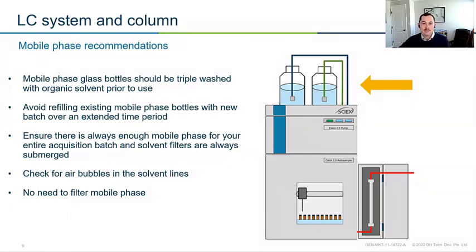Algae will grow in these bottles. And over time, you can end up with this pretty nasty film that can be pretty difficult to remove from your tubing. Honestly, it's just easier to replace the tubing. So when you're going to your LC system, make sure that you're not just refilling the bottle. It's okay to do for sure if you're just in between runs, but we don't want the same bottle on top of your LC for weeks and weeks and weeks. You're just inviting the growth of some algae that's going to be a pain for you to get rid of.